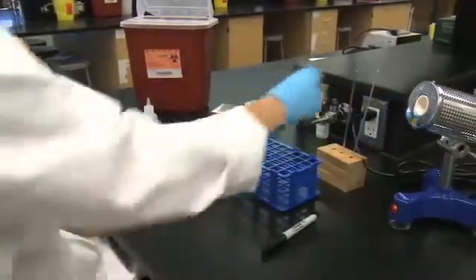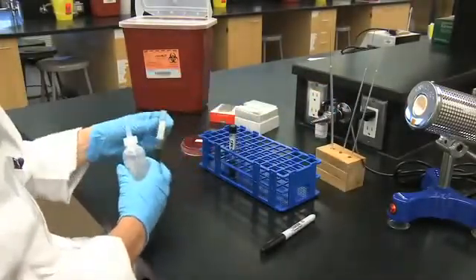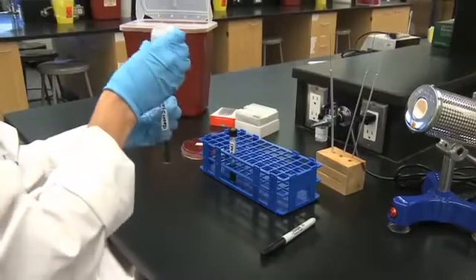Add sterile mineral oil to a depth of at least one milliliter to all tubes labeled closed.